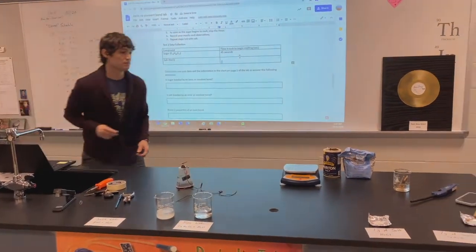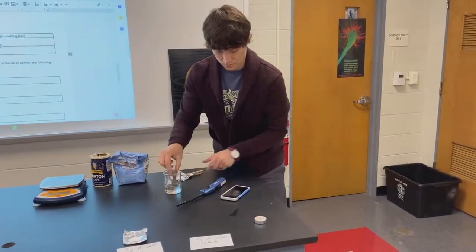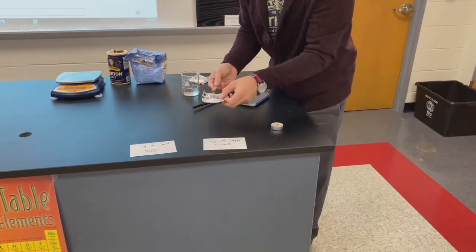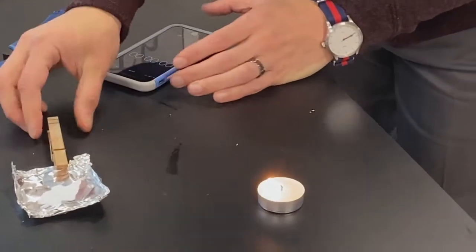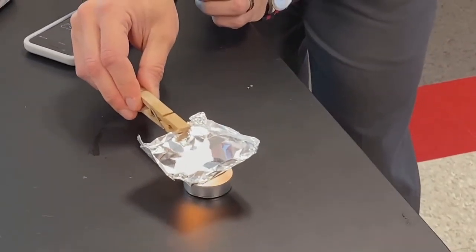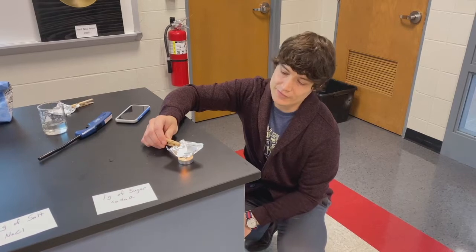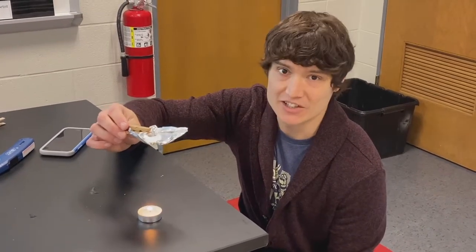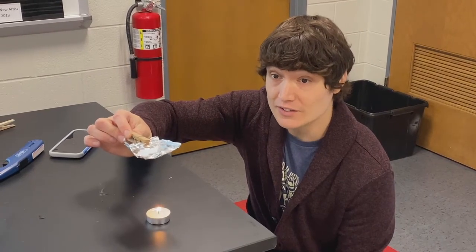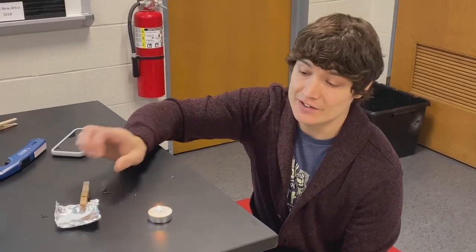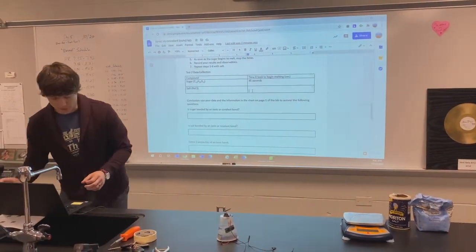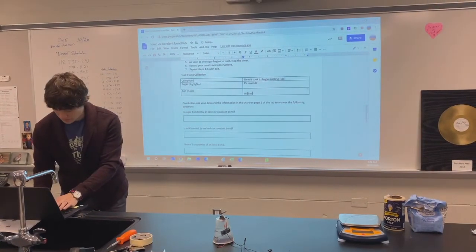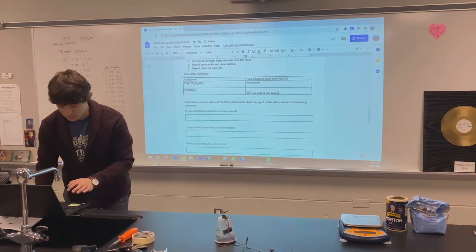Moving on to salt. Set my timer, put it on there, light my tea light, and start. I've been waiting here about five or so minutes and spoiler alert — this is not going to melt. We need 1474 degrees Fahrenheit to melt salt. We are not going to get anywhere near that with our little tea light. So we can stop there and just put: will not melt at this temperature.